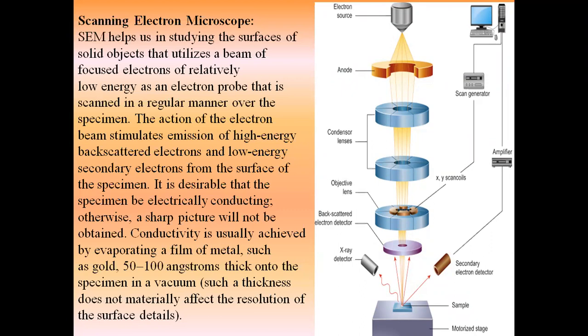Once the electrons fall on the sample, if the sample is not able to conduct the electrons, you will get a complete black image.